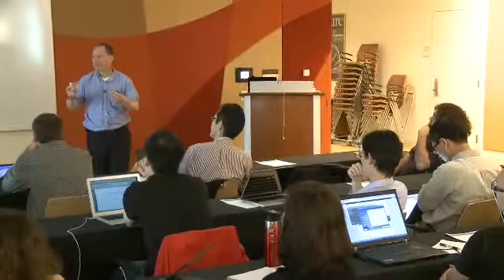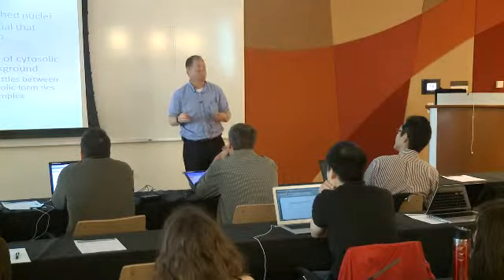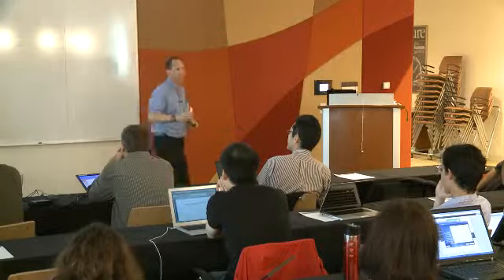Elan, most typically working with very, very limited numbers of cells, typically uses a one-step method to avoid the loss of material with the washes. We're doing some of each, depending on the availability of cells, although we're trying to converge on a single method that we can use for everything.